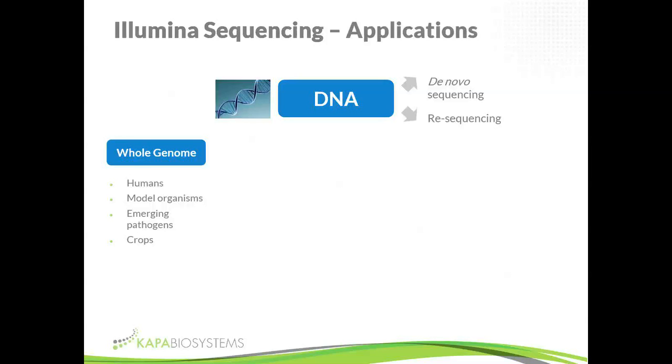provide us food. And so because whole genomes are big and they're expensive to sequence and they generate a lot of data, a lot of especially resequencing is called targeted sequencing, where we sequence smaller units of the genome. So for instance, we can sequence just the exome, so all the expressed genes really in the genome, or we can sequence anything that's called a custom panel.